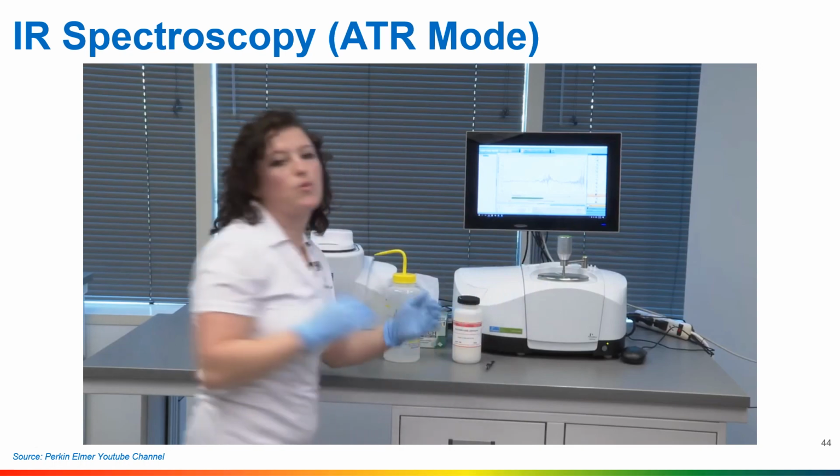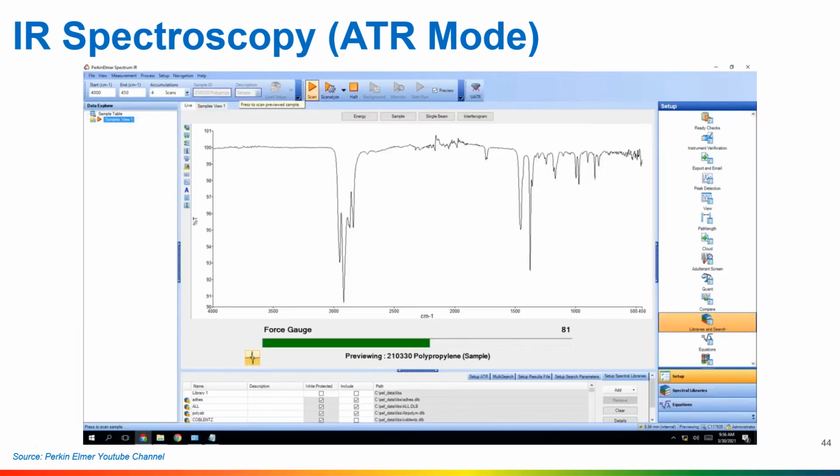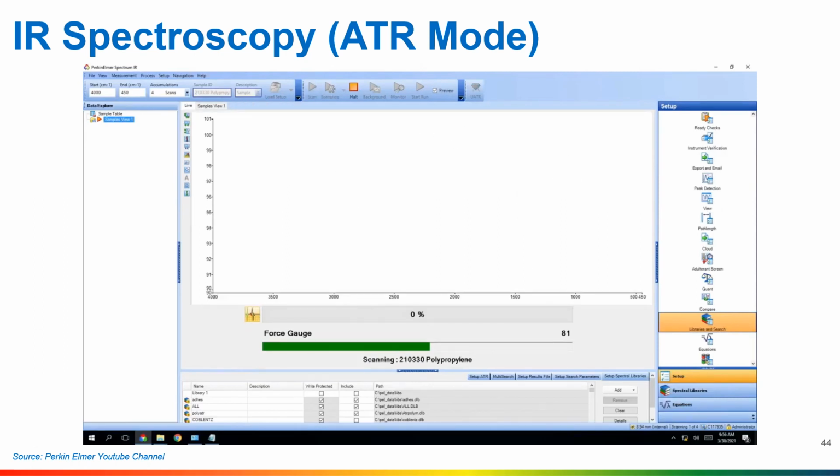This is usually around 90 force. You'll see some good peaks show up. Once you have a good spectra, go ahead and hit scan again. Scanning again will actually start collecting the data.